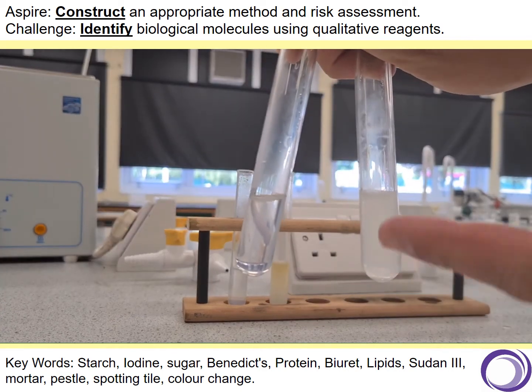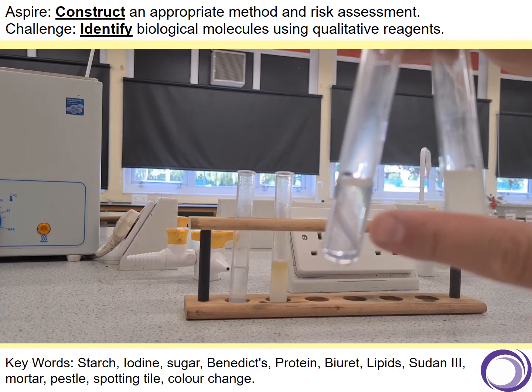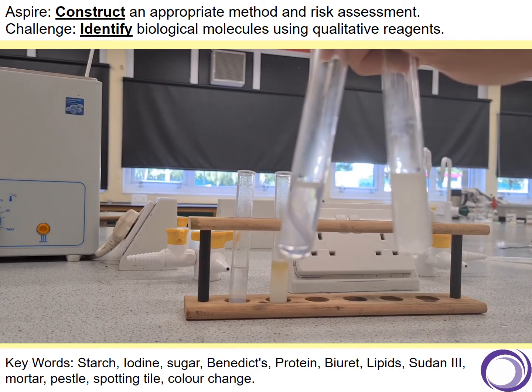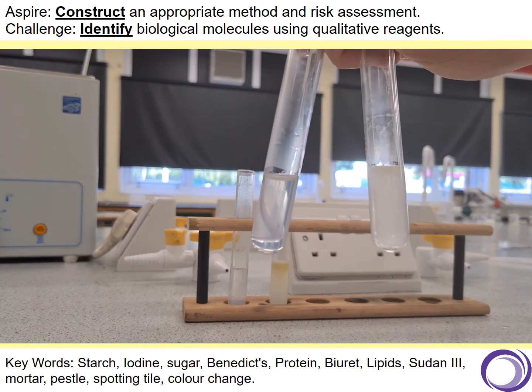Okay, so this one here was the butter one, which has definitely gone cloudy, and this is the glucose one, which hasn't got cloudy. So the positive test for a lipid, add ethanol to your food, shake it, and if it goes cloudy, then lipids are present.